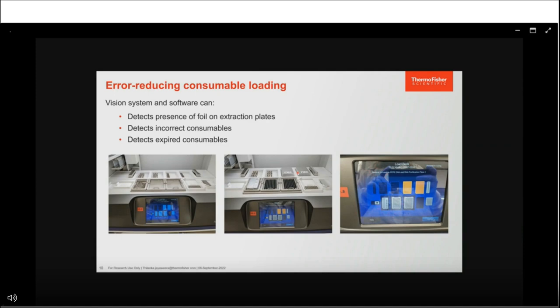As an example, when loading plates, we purposefully loaded two plates with foil seals. The instrument highlighted these in orange color to indicate they are incorrect, and prompted the user to correct the error with the message to remove the foil from the plate. Once you correct any errors, the instrument will then prompt you to start the run.